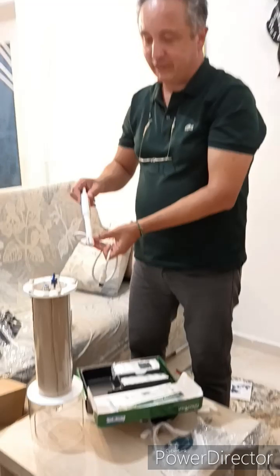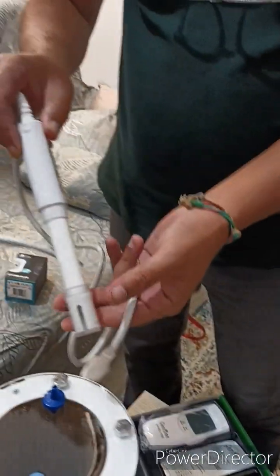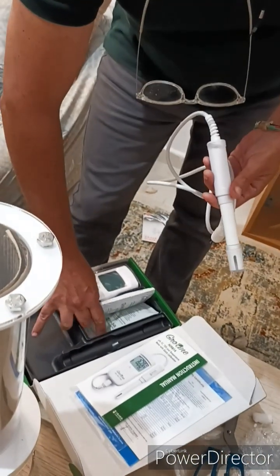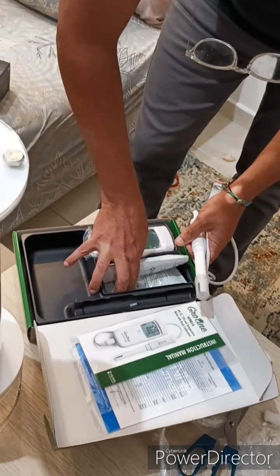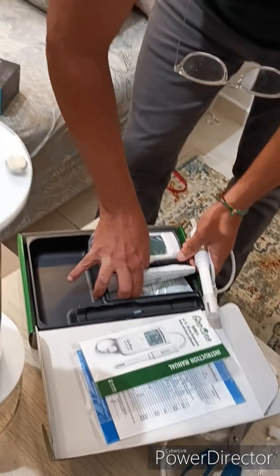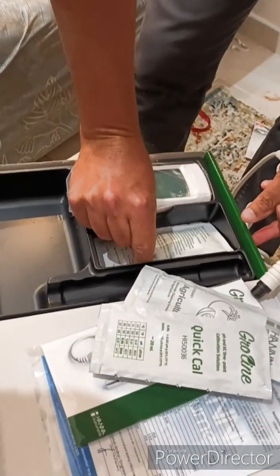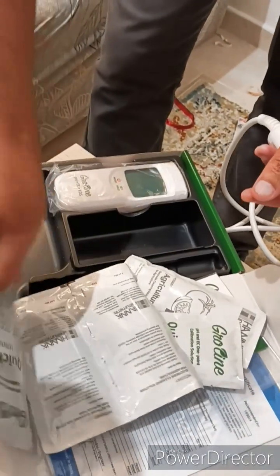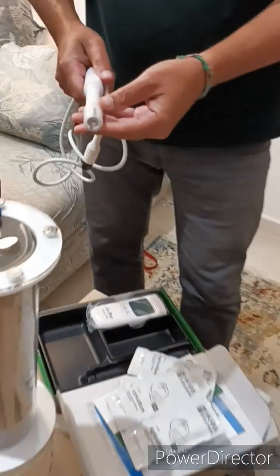This is a multi-probe, so we will measure different parameters altogether. There are calibrating solutions — a calibrating solution for pH and a calibrating solution for electric conductivity. Here you can see the time we recorded this.